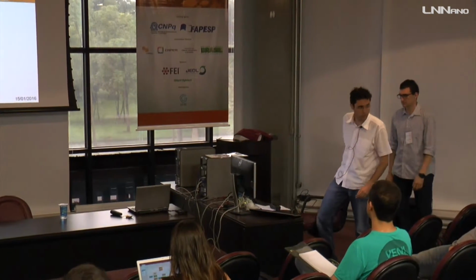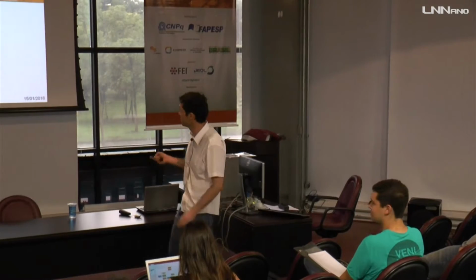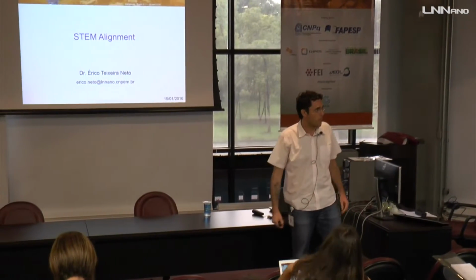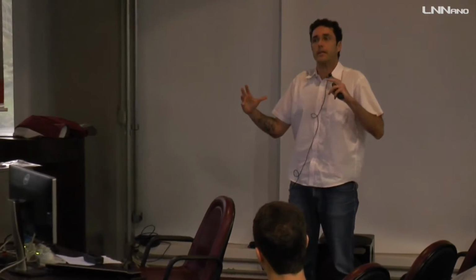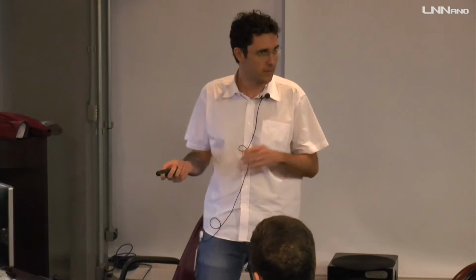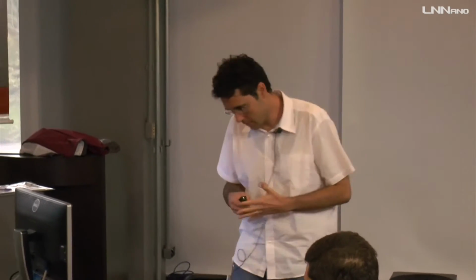Good afternoon, students. Let's go to this section of STEM alignment. What I will do for you today is to show the operation of the machine in STM mode. I will not be too worried about showing all the details of the operation.